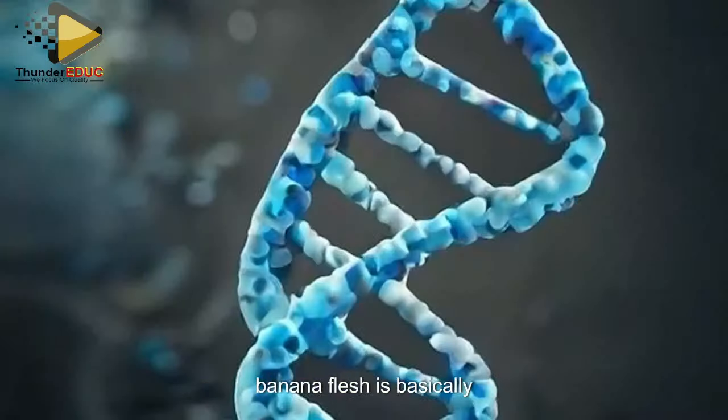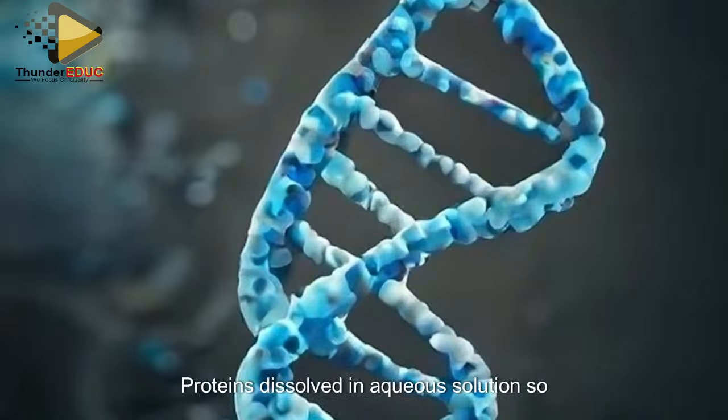Pulping the banana flesh is necessary for breaking the cells or opening them, and also increases the surface area for the extraction. Then table salt, we can say that it keeps the cellular proteins dissolved in aqueous solution so that they do not precipitate in alcohol along with DNA. So basically it's just to help the DNA not dissolve with alcohol so that they are separated.